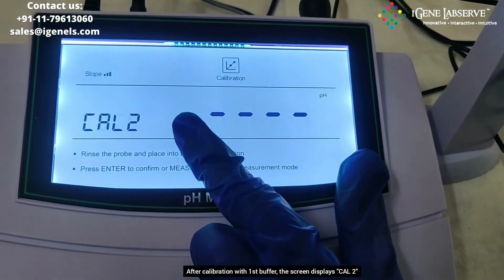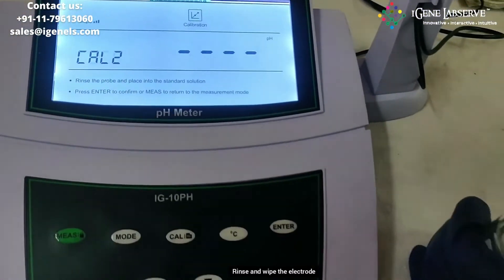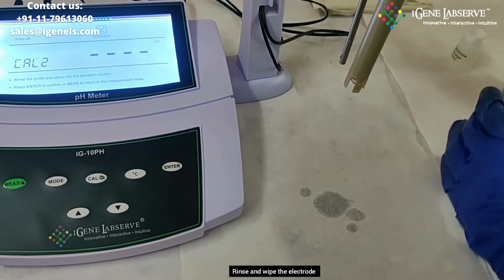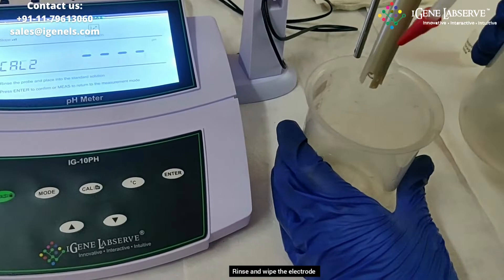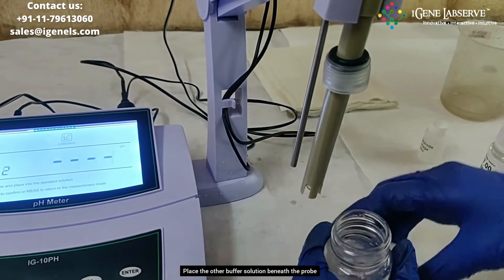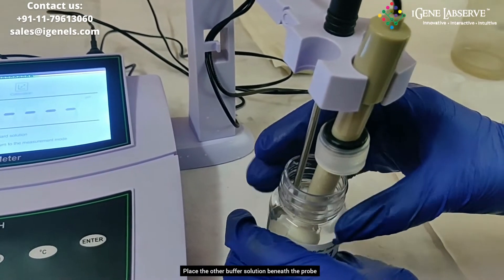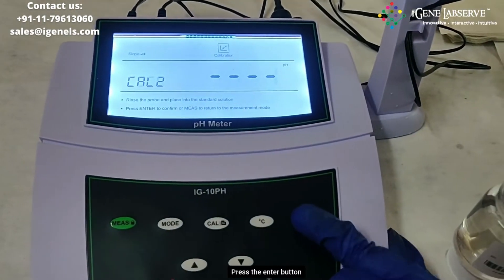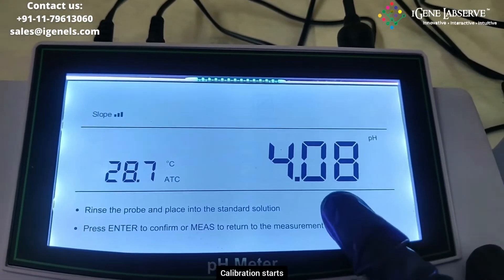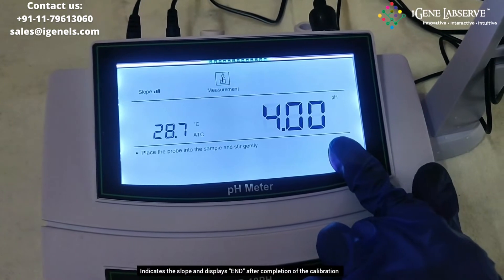After calibration with the first buffer, it automatically enters the second calibration step. Remove the electrodes and wash them again using the wash bottle, then wipe them. Take the second buffer solution and place the probes in it, then press the enter button again. It automatically detects the buffer solution and begins calibration. The display then shows the slope value and indicates 'end', meaning calibration is now completed.